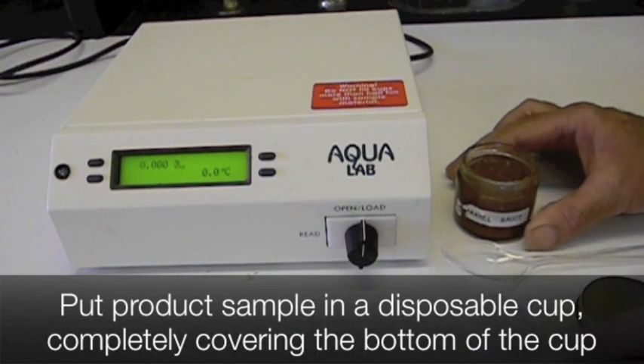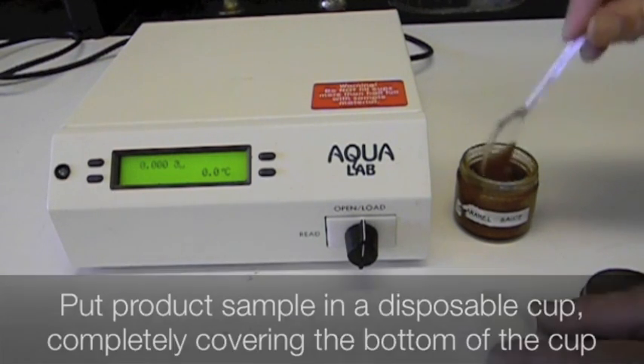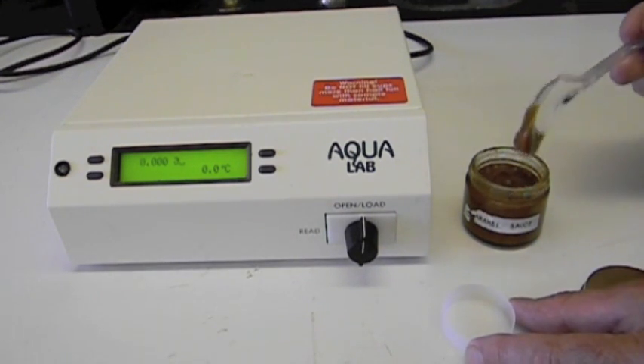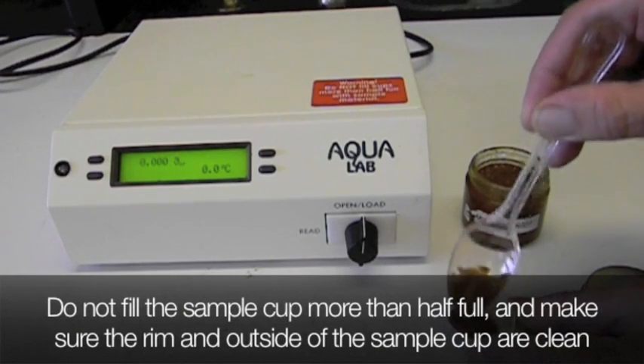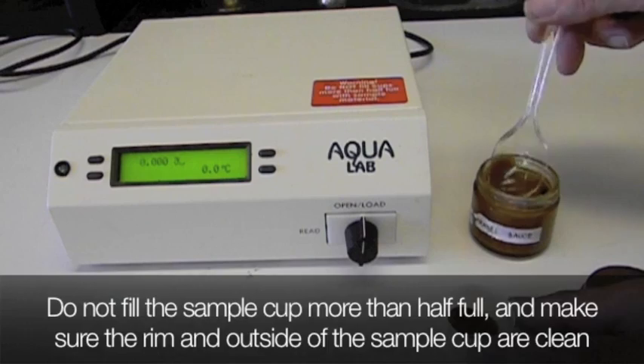Put the product sample in a disposable cup, completely covering the bottom of the cup. Do not fill the sample cup more than half full, and make sure the rim and outside of the sample cup are clean.